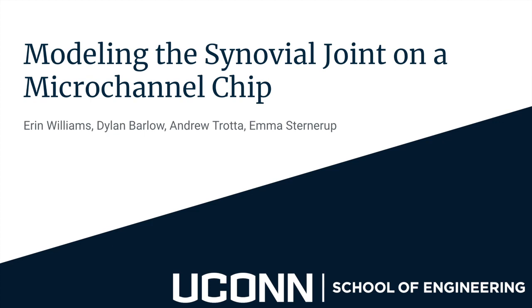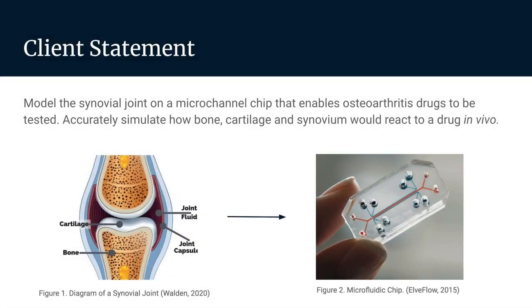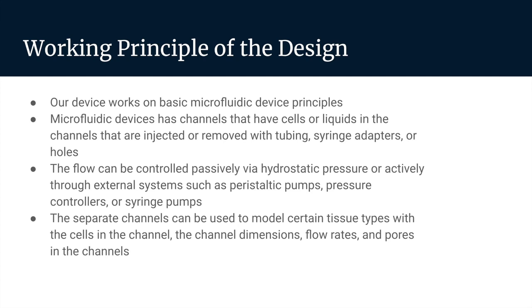Our project was to model the synovial joint on a microchannel chip. Our client wanted us to model the synovial joint on a microchannel chip that would enable osteoarthritis drugs to be tested. The chip would also have to accurately mimic how bone, cartilage, and synovium would react to a drug in vivo. Our device works on basic microfluidic device principles.